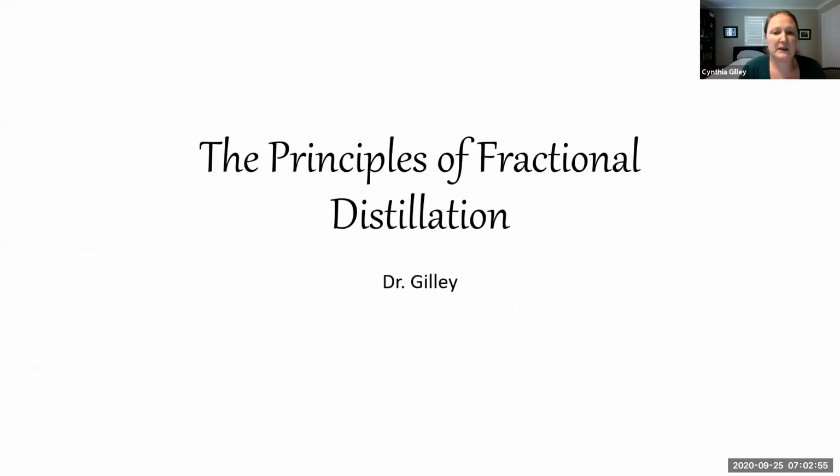Okay, the beginning of this video will likely be review of fractional distillation that you learned about in the first semester organic chemistry lab. But eventually we should be going over some new topics that you may not have learned in your previous organic lab.